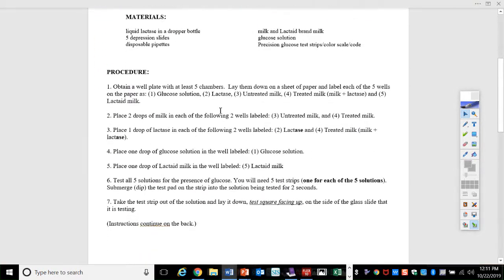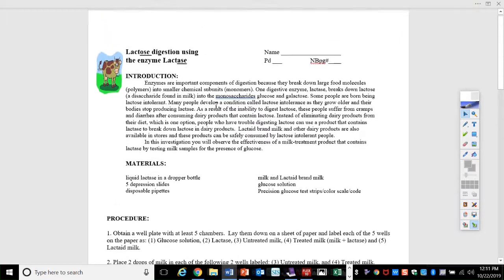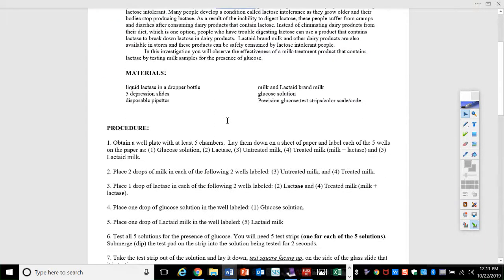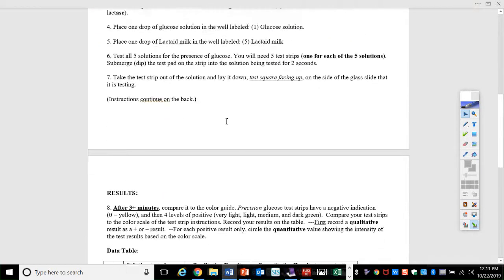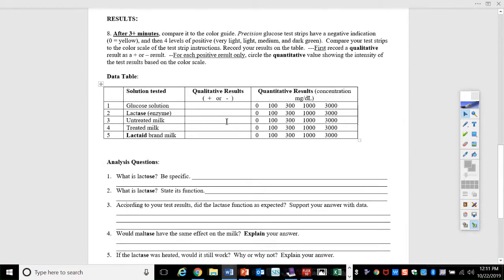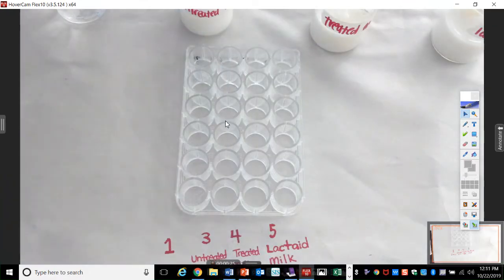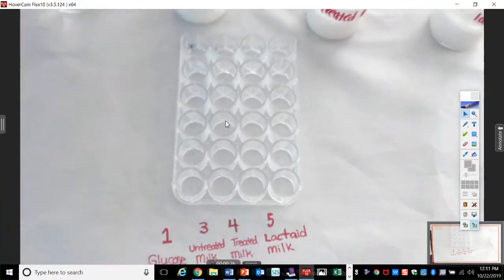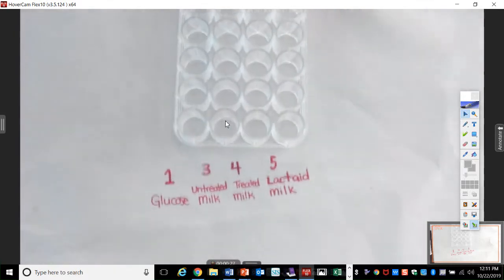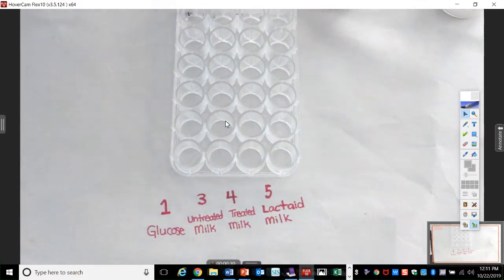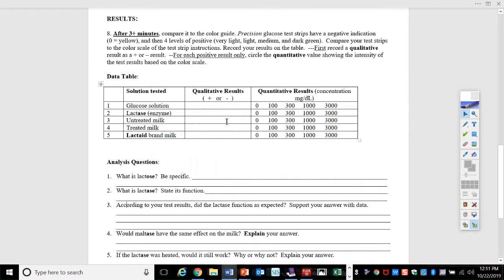So here are your directions. You've got a well plate that we're going to use. You might notice we have labeled these five things. On your chart, number two is missing. We're not going to test the enzyme for the presence of glucose.